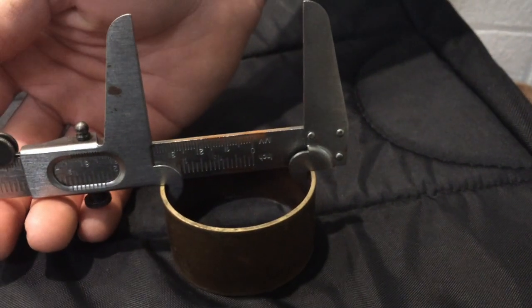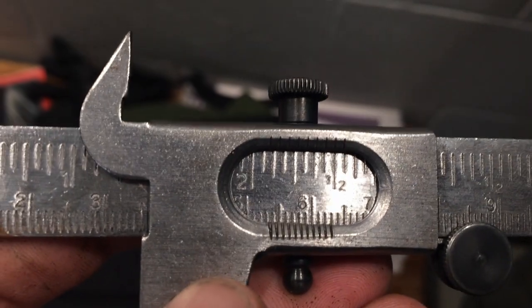Use a caliper or ruler to measure the inside diameter and the height of the ring.